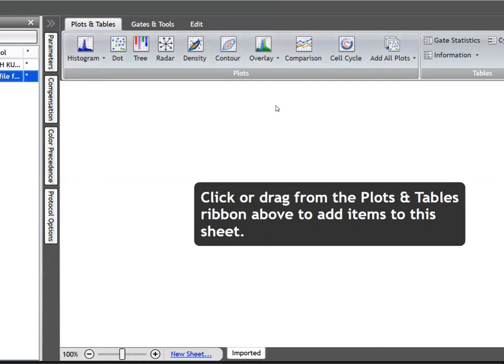Okay, right. Now see, this is the third-party Kaluza software, which is from Beckman Coulter. As I said, I would request all of you to download this. It's a bit of a lengthy process, but still give some time to download it. I'll share the number of a person who will help you in downloading this. Please work with some files. I'll be sharing some files in the upcoming talks, because that is more related to analysis. So we'll be having stem cell enumeration, lymphocyte subset analysis, and PNH.